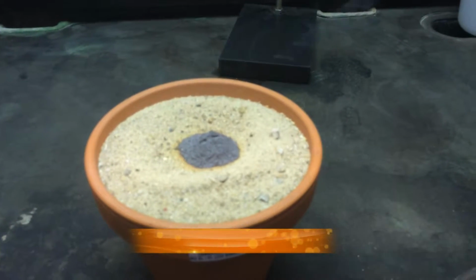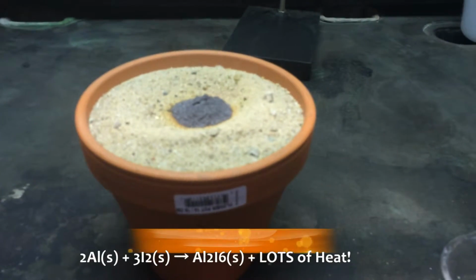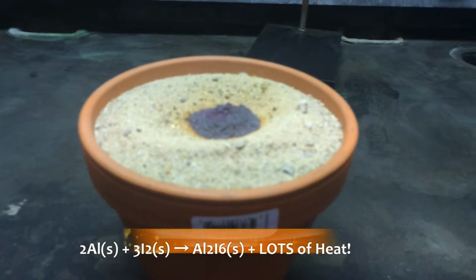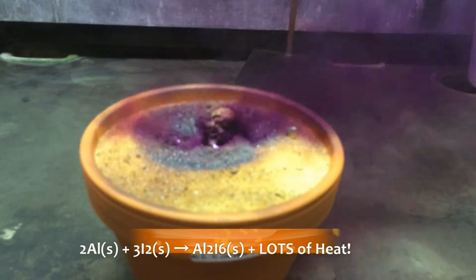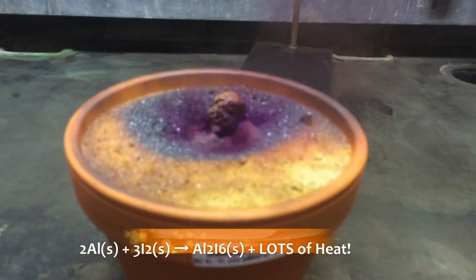Now the iodine actually acts as an oxidizer, but adding water speeds up the reaction. You're going to have aluminum iodide produced as a solid, and you will be releasing iodine vapor as a gas. So there's the first part of the reaction. As you can see, the aluminum iodide is being generated there.